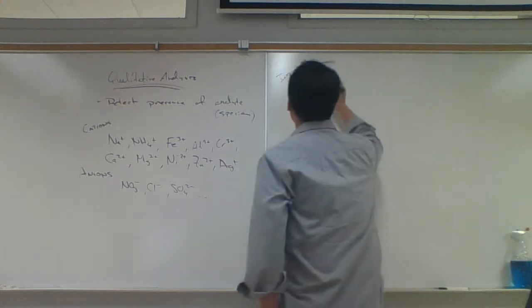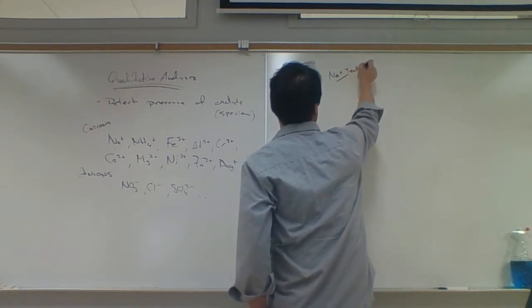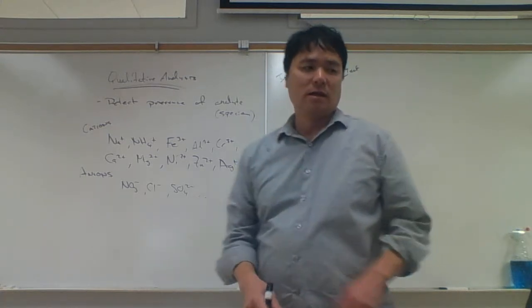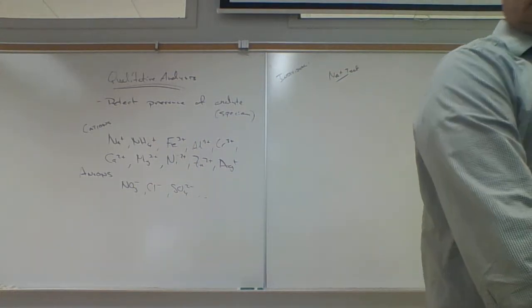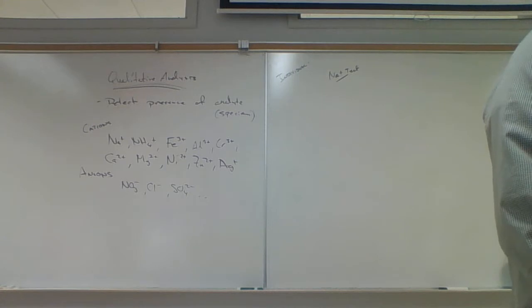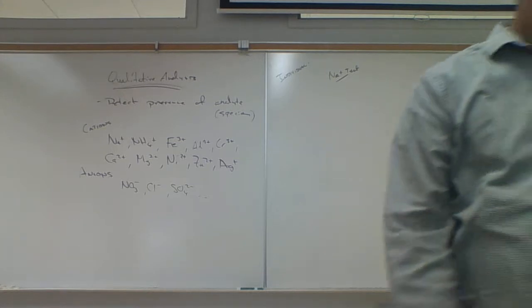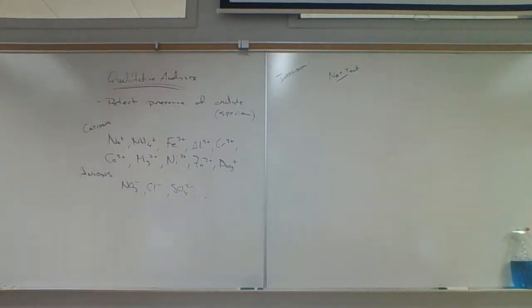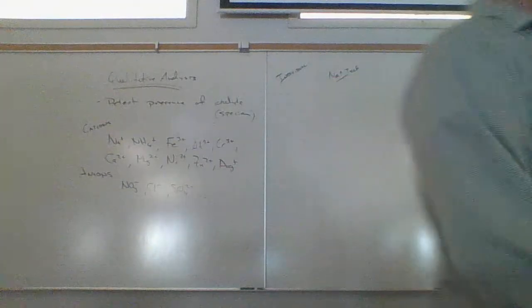And so for individual tests, we'll have something like the sodium ion test. The sodium ion test, what that consists of is, well, sodium is actually easy to detect via flame. And so let's take a look here. We have our standard blue flame. This is a methane flame here.